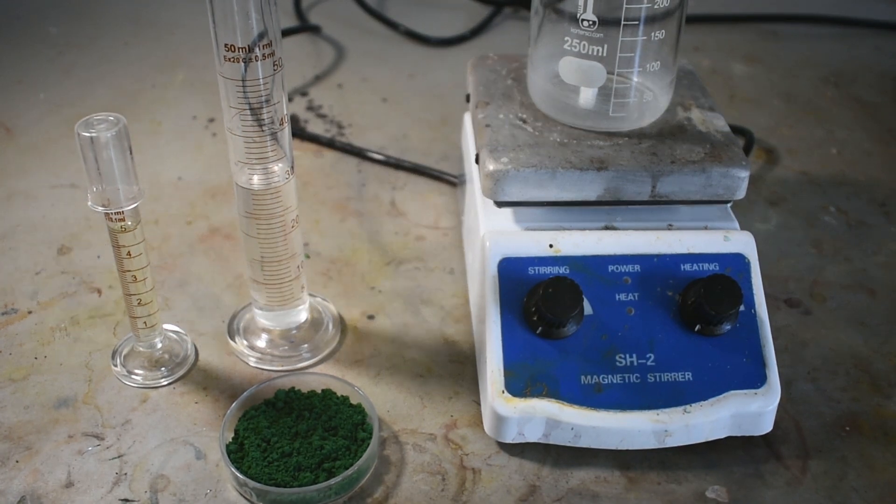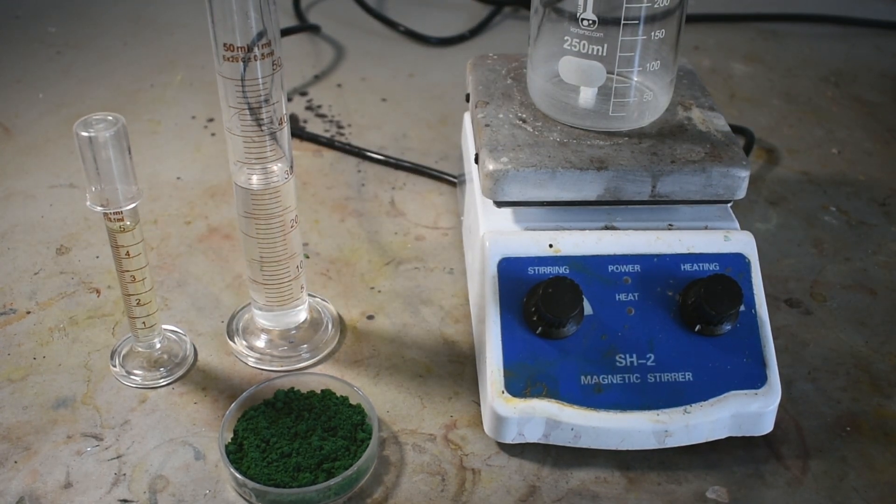Hello everybody and welcome back to the long-awaited return of my longest-running series, Colorful Complexes. In the first part of this video I'll be making cis-dichlorobis(ethylenediamine)chromium(III) chloride. This is a fairly simple complex but has quite an unusual synthesis.